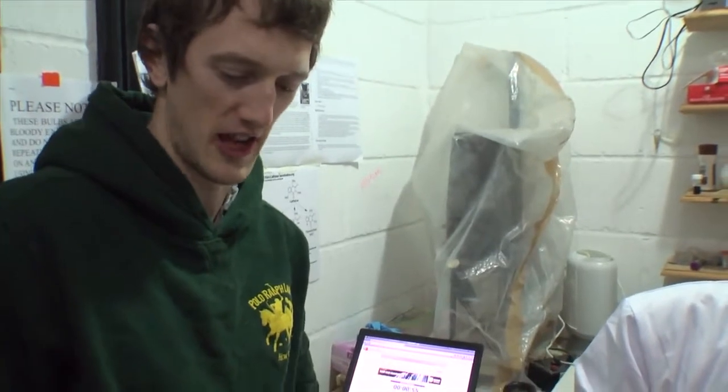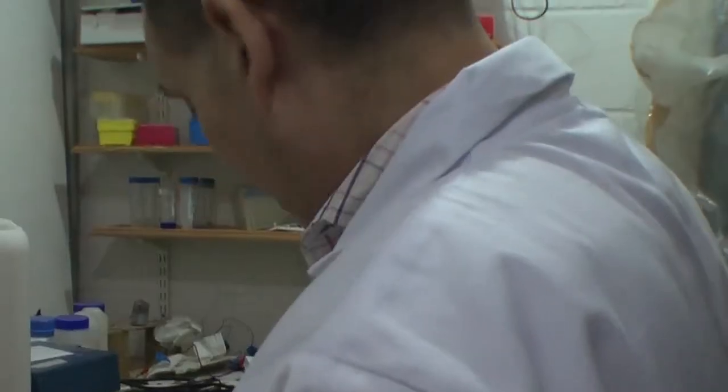We put the samples in the centrifuge to get the solid cheek matter down to the bottom of the tube, and then we can throw away the water. These are old vintage centrifuges that we're very proud of. Whee!